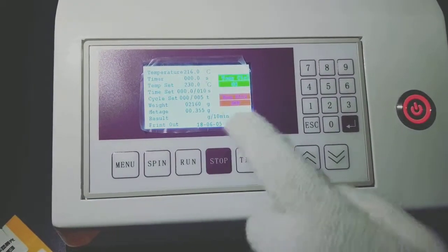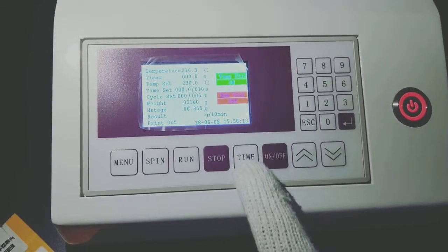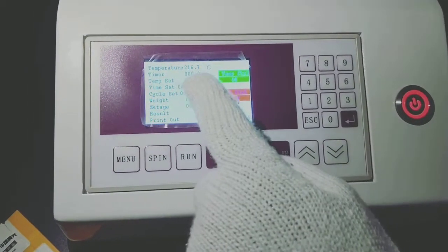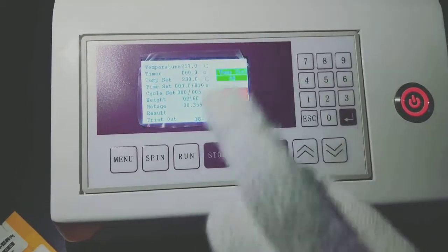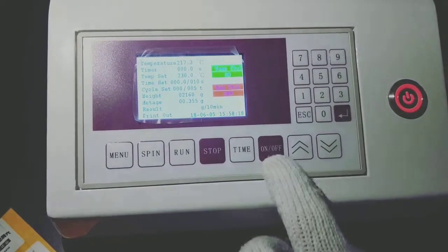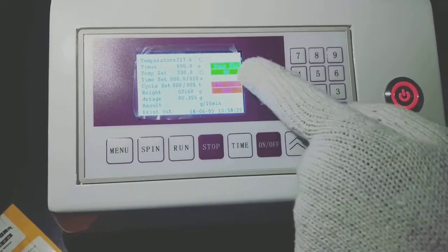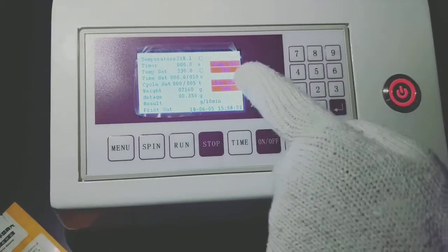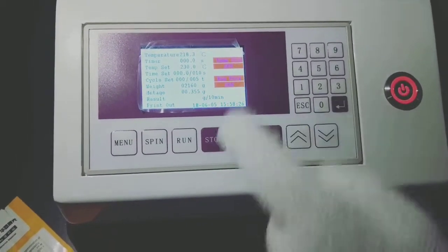Stop. And this time key is used for calculating the 4 minutes keeping time. And this on-off is used for controlling the temperature heating. When this red color is off.